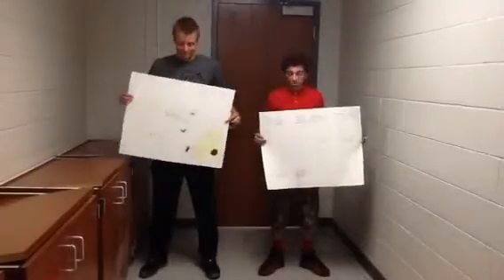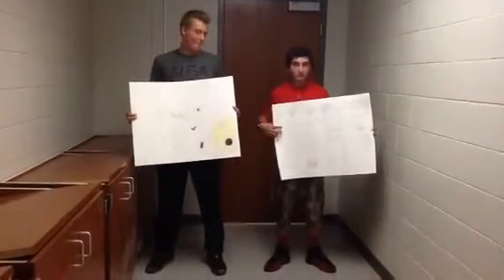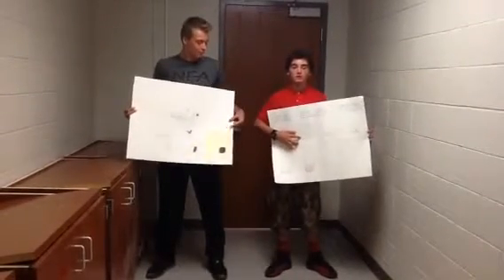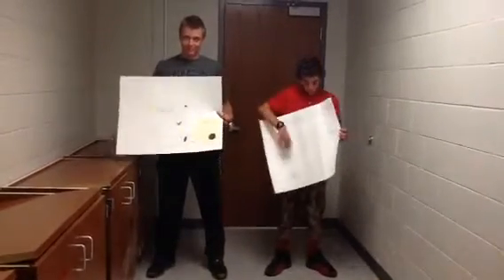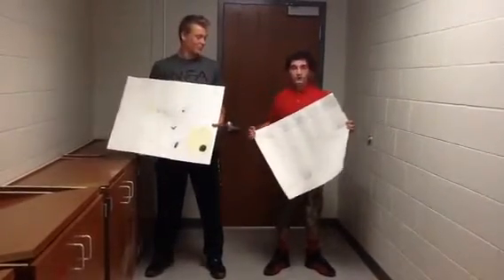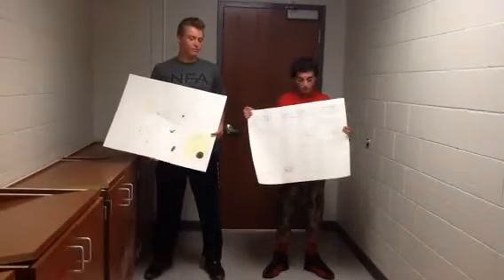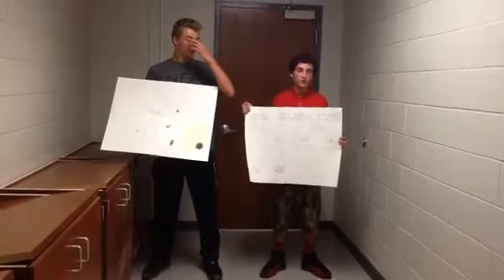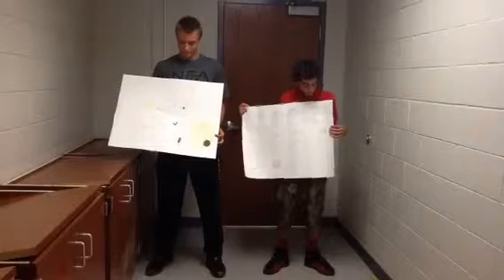To start off with the ELISA test, you start off with a bunch of wells, and they're coated with a specific protein to see if somebody has a disease of some sort. And then you put a solution of primary antibodies in the well, and the primary antibodies will attach to the proteins at the bottom of the well. And then you dump that solution out for the excess antibodies, and then you wash it out for any excess.